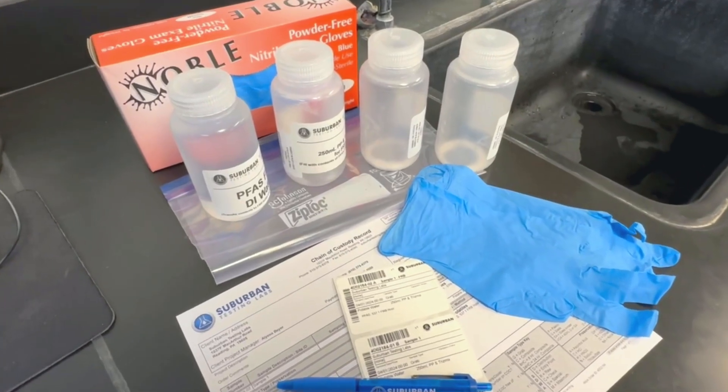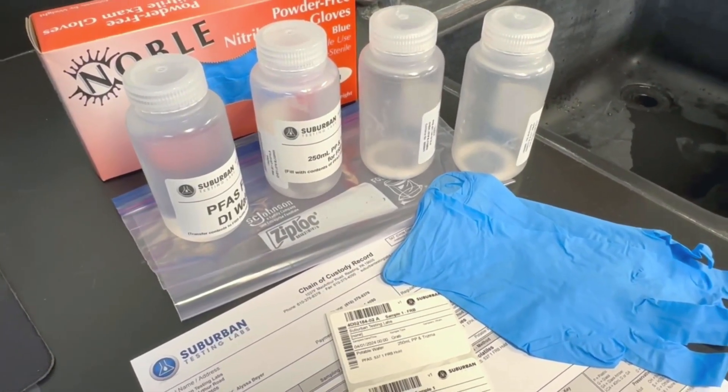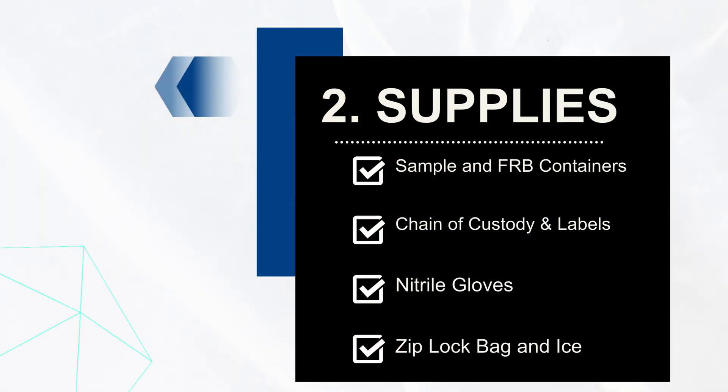Before taking the samples, review your kit to make sure you have everything you need, including your sample and field reagent blank, which contains PFAS-free water, an accurate chain of custody form and label. Have at hand some nitrile gloves — not latex or neoprene — gallon Ziploc freezer bags, and a cooler with wet ice.